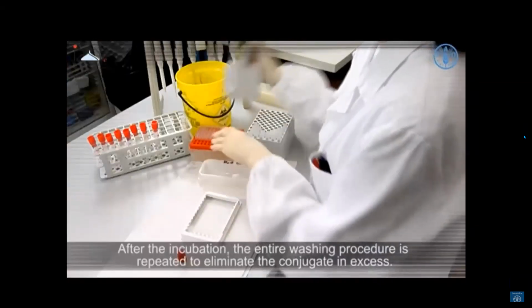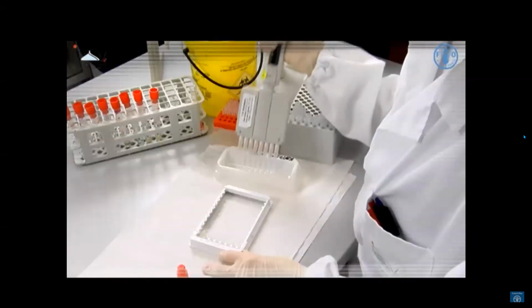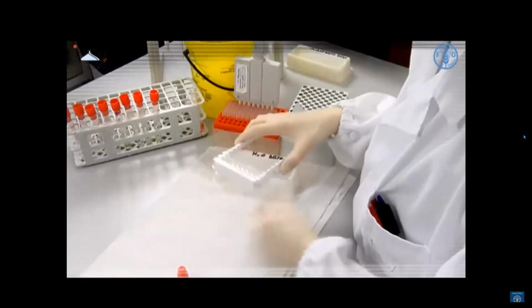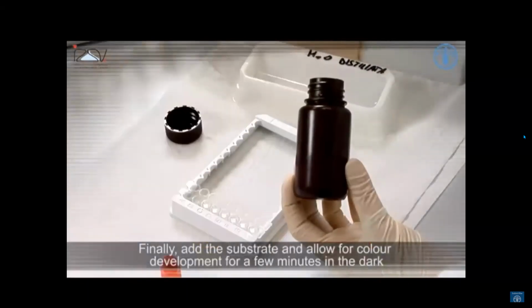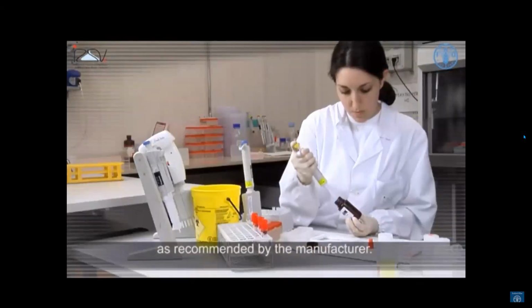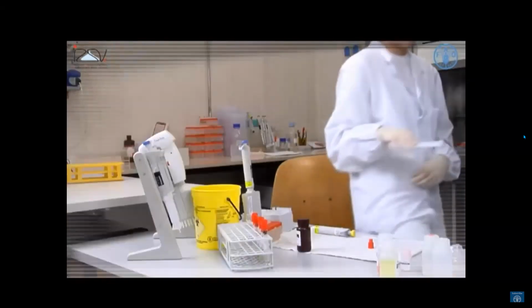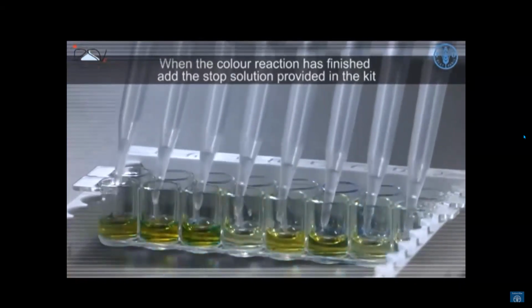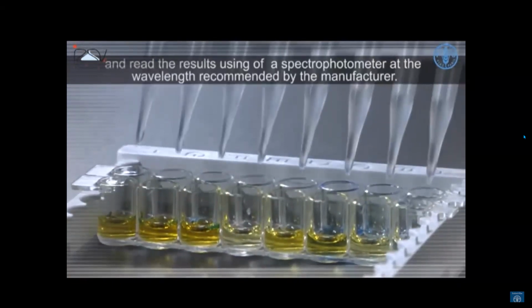After the incubation, the entire washing procedure is repeated to eliminate the conjugate in excess. Finally, add the substrate and allow for color development for a few minutes in the dark, as recommended by the manufacturer. When the color reaction has finished, add the stop solution provided in the kit and read the results using a spectrophotometer at the wavelength recommended by the manufacturer.